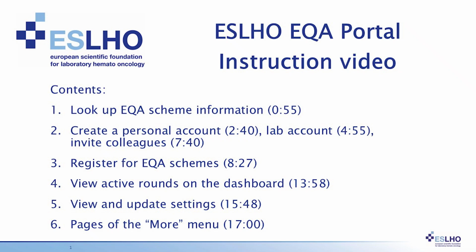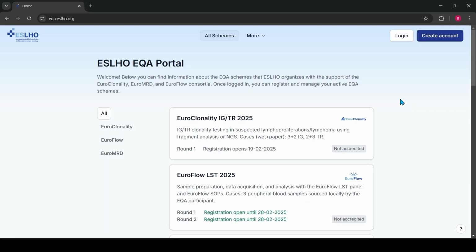This is an instruction video for the new ESLHO EQA portal. On this website, you can find information about the EQA schemes of Euroflow, EuroMRD, and Euroclonality. You can also register for these schemes and manage your schemes, including submission of results and downloading your reports.